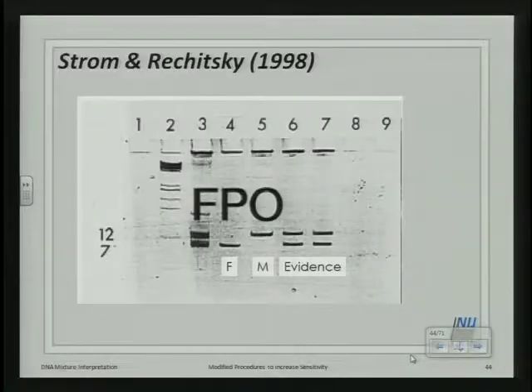then you would get an additional number of amplicons that can give success. In this paper they used it in a case where they're trying to identify an individual. They have the mother and father alleles here, and they were trying to identify from the evidence the son. So they were able to get it. No result with the first round of PCR, but were able to get results with nested PCR. But of course, that method suffers greatly from potential for contamination.